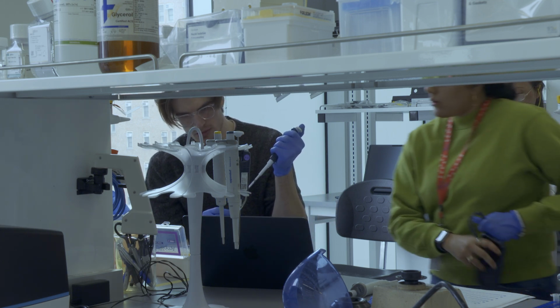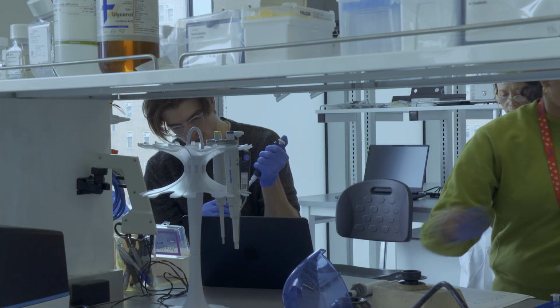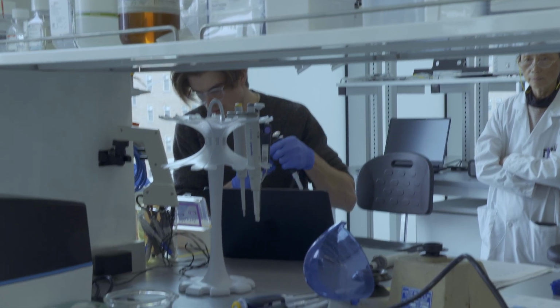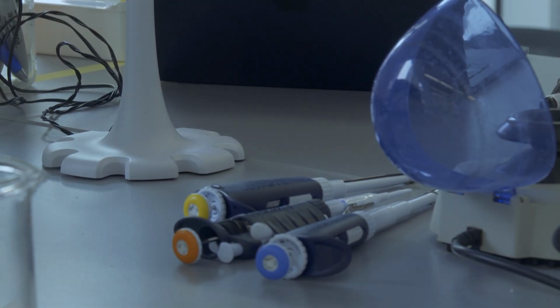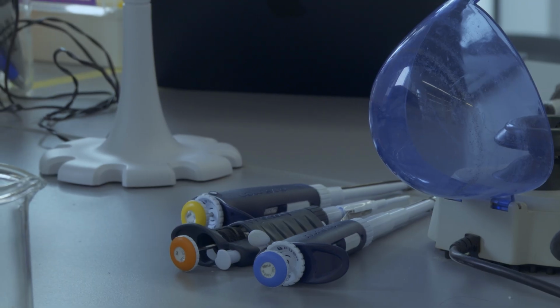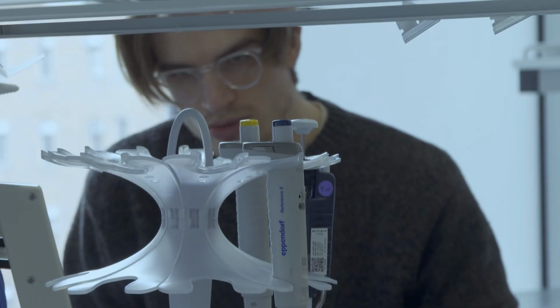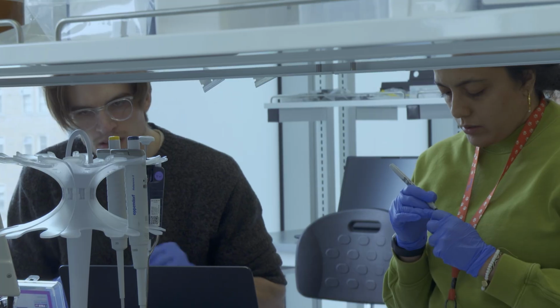Could you make one more tube for plasma too? Okay, I'll make one. Thank you. What should I name it? Plasma 2. Okay.